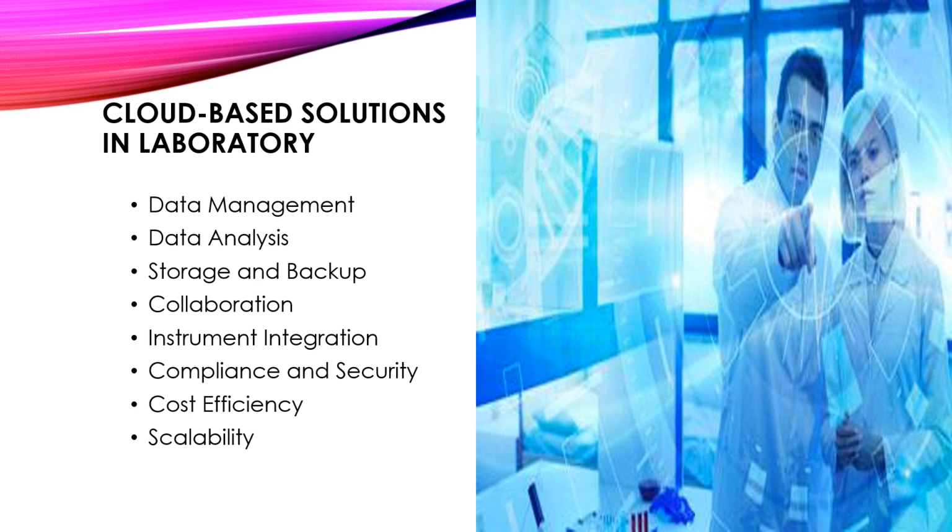Cloud-based solutions in laboratory. Cloud-based solutions in laboratories refer to utilizing cloud computing technology to manage, analyze, and store data generated in laboratory environments. These solutions offer numerous benefits such as scalability, accessibility, collaboration, and data security. The following are some examples of cloud-based solutions in laboratories.